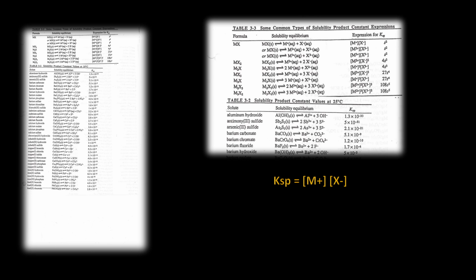As mentioned in the previous slides, the Ksp value is important in determining if a compound will precipitate or not. The group 4 compounds have higher Ksp values and will not precipitate easily. Adding hydrogen sulfide gas to the solution results in some of the gas dissociating in the solution. The equation shows that the gas becomes one atom of hydrogen and a hydrogen sulfide compound, which then further reduces to 2 hydrogen atoms and 1 atom of sulfur.